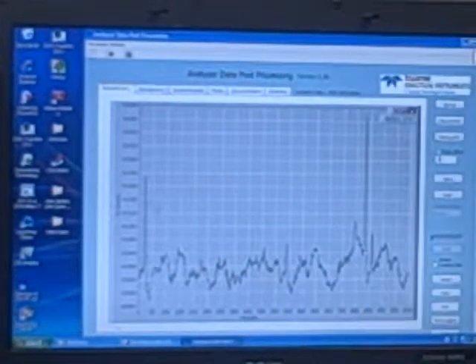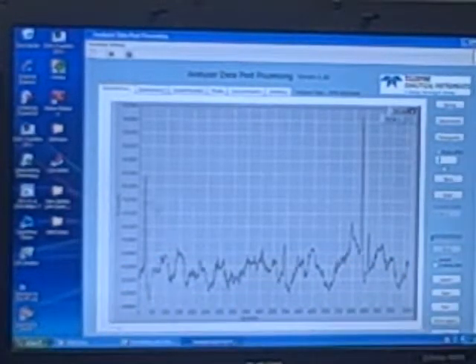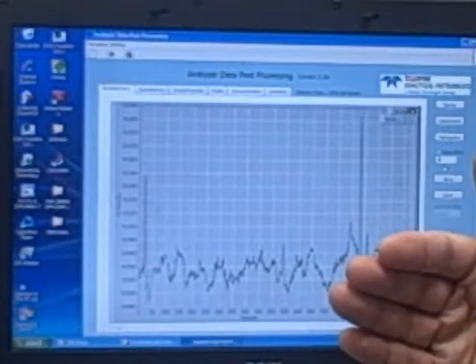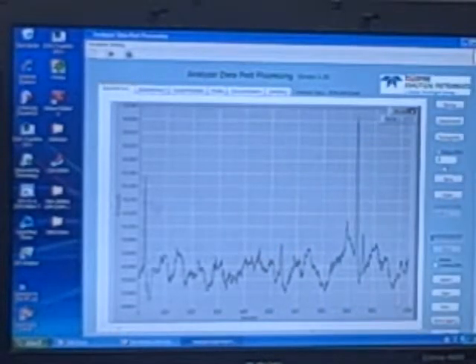You can stop anytime. If you say only 2 cycles, the data will keep displaying after 2, but it will not be saved. So only 2 saved. Remember that.